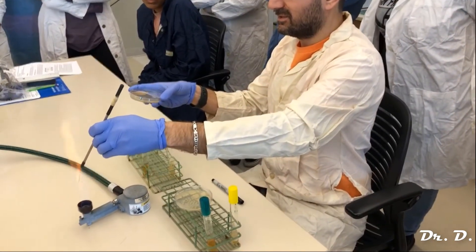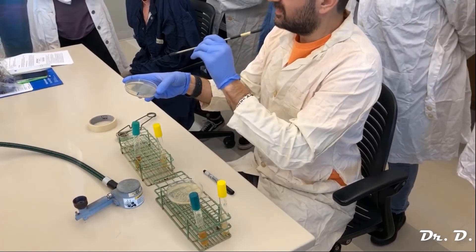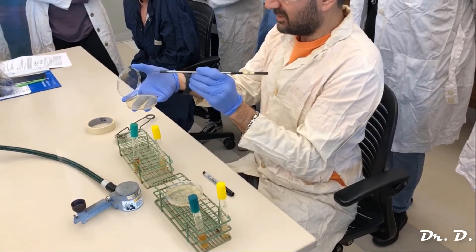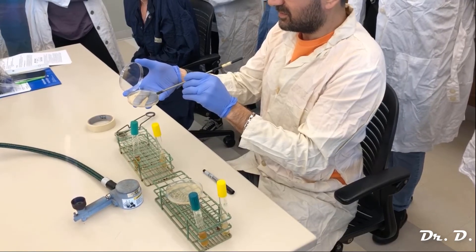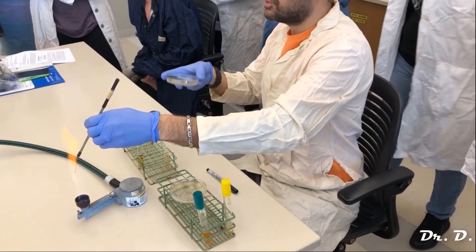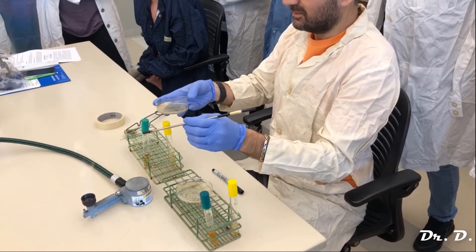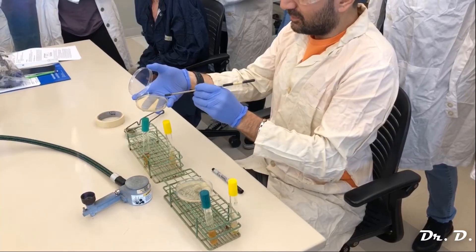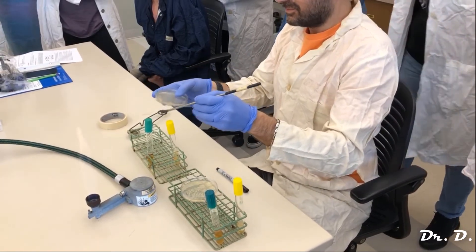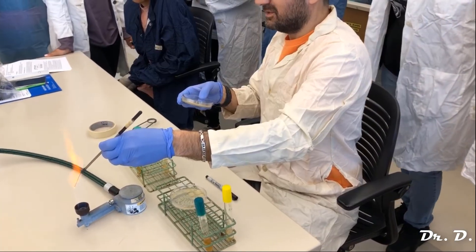Now I need to flame again to kill all those bacteria. What I'm going to do now is drag bacteria from zone one into zone two. There's no bacteria on the loop now, but when I go into zone one I pick up some, streak zone two, and then never go back into zone one. I flame again. Zone two should have fewer bacteria — I may or may not get single colonies there. For zone three, I go into zone two twice to pick up some bacteria, then never go back into zone two. Zone three should have the fewest bacteria, and that's where I should see isolated colonies.